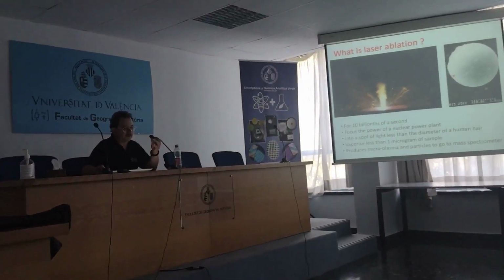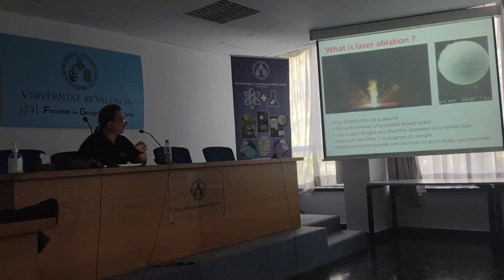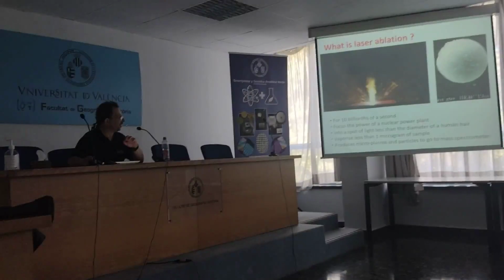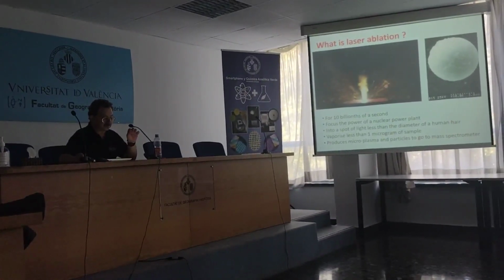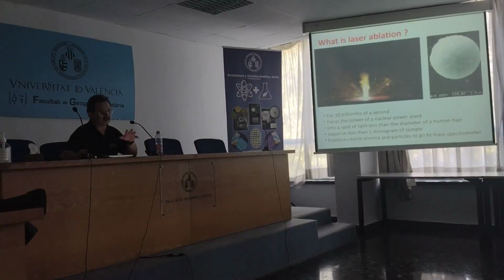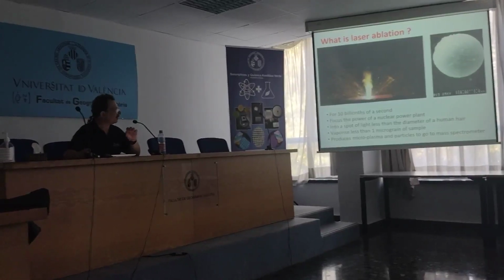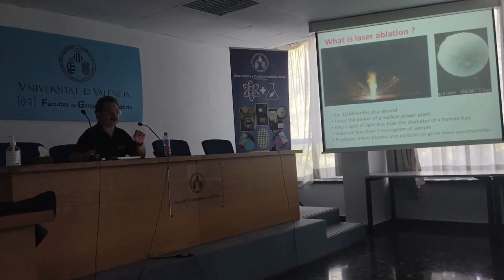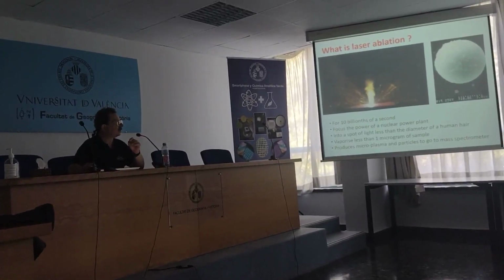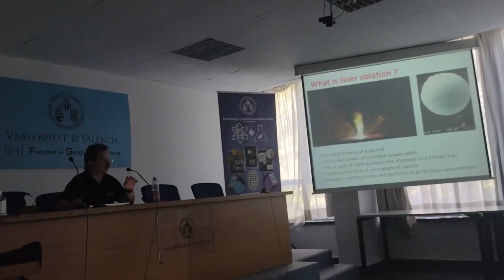And the laser then makes what's called a microplasma, and in fact you can see this is here. This is actually a picture I took for my PhD 30 odd years ago. And so this is a plasma, very hot, and you can see particles coming off. So this is actually some steel ablated in air. Normally for the analysis we do it in a different gas, but the steel particles burn in the air so you can see them coming off. And here on the right we have captured with a filter some of the particles. This is a big particle. Actually, most of the material is very fine, below 1 micron, and you can see this perhaps in the background.